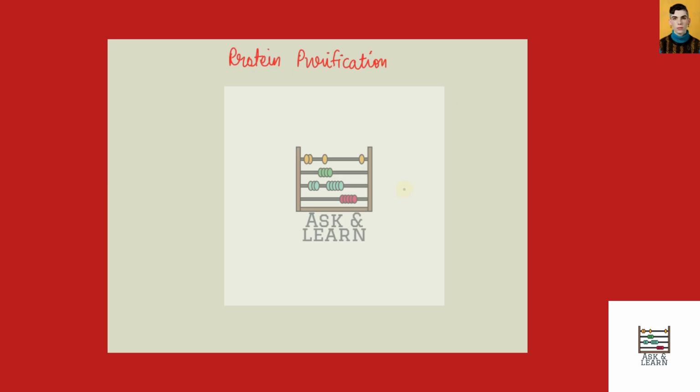Hello students, in this question we have to tell about two techniques which are used for protein purification. First technique is gel filtration and the second technique is SDS PAGE.